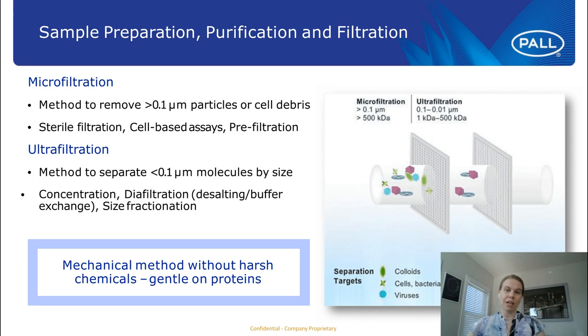And when we think about filtration, we are thinking about two major aspects of filtration, which are microfiltration and ultrafiltration. And if you look at the image on the right-hand side of your screen, it may help you to better understand the difference between those two filtration methods.